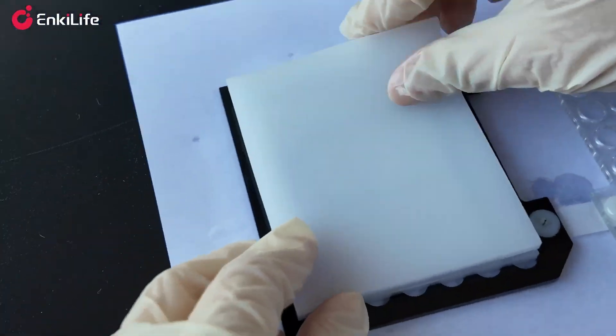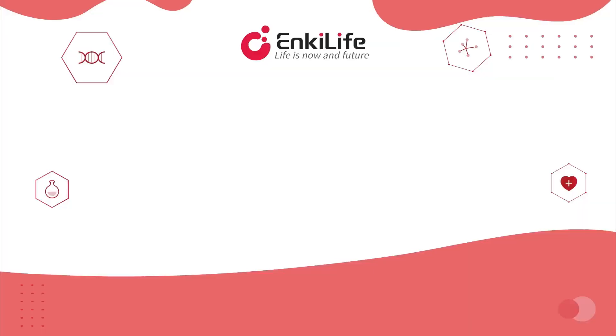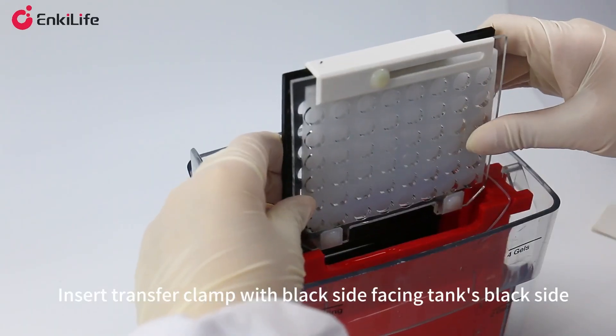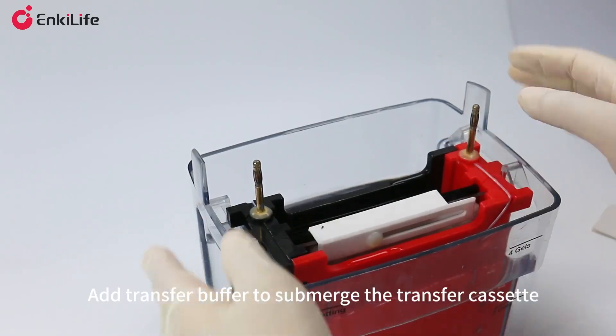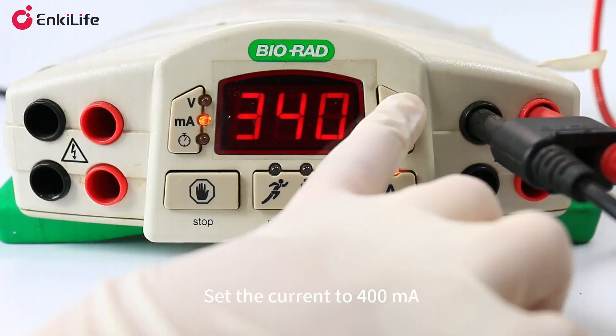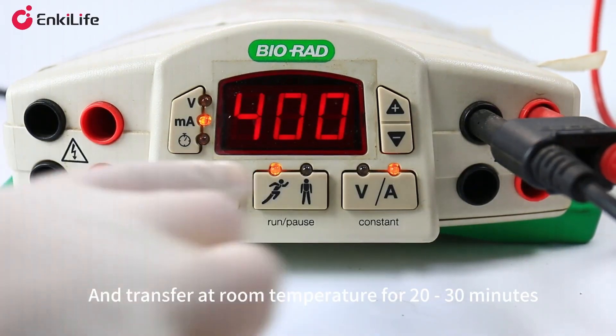Then lock the transfer clamp securely, ensuring no air bubbles. Insert the transfer clamp with the black side facing the tank's black side. Add transfer buffer to submerge the transfer cassette. Set the current to 400 milliamps and transfer at room temperature for 20 to 30 minutes.